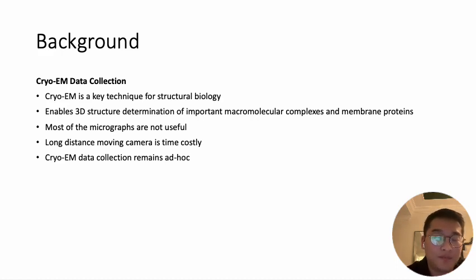However, most of the micrographs the microscope collected are not useful. And if we want to move the camera to different locations in a very large grid collected by a microscope, it's going to take a very long time to do long distance moving.